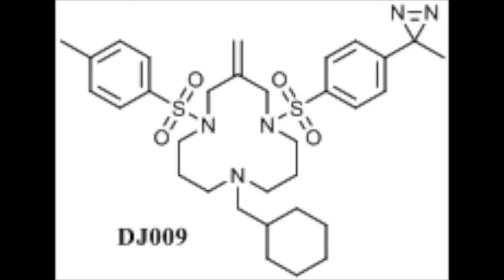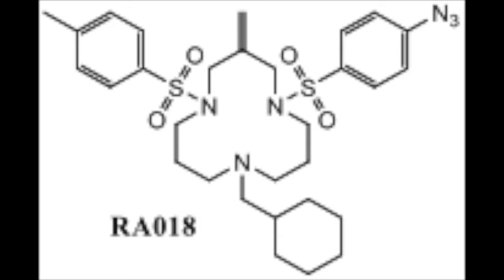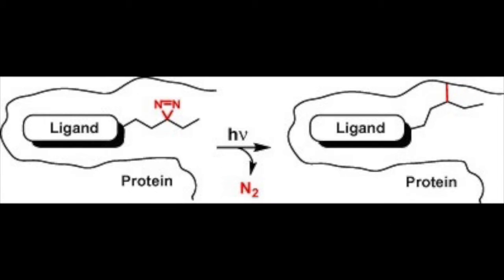So I have several different research projects going on right now. My main focus is on figuring out which amino acids on the signal peptide are involved in binding to CADA. This is done through a technique called photoaffinity labeling, in which you synthesize an analog that has a photoreactive group on it, and then you allow that to bind to your target. You shine UV light on it, and it generates a very reactive intermediate that will quickly insert into whatever's nearby.